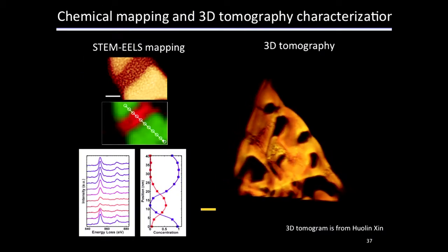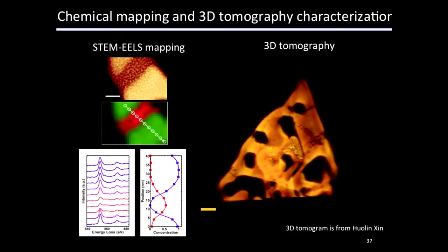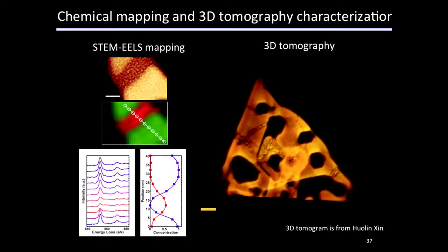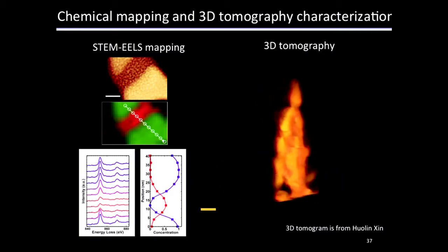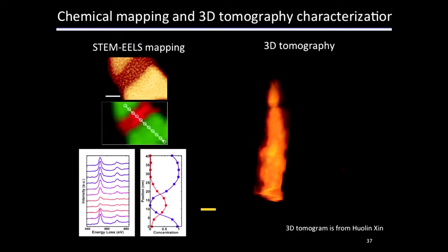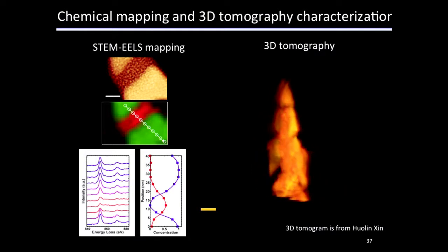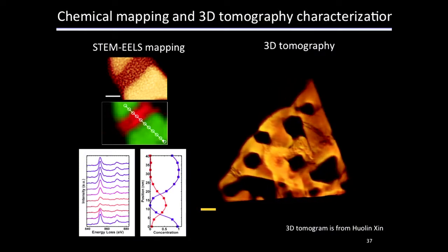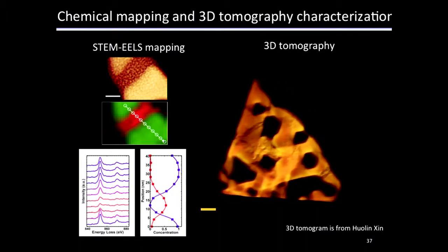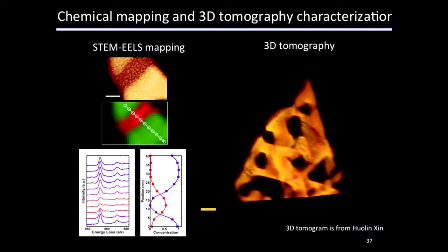So we did further analytical TEM. On the left is the STEM EELS result. This is an ADF image. We can see reaction fingers here. This one is an EELS mapping of this area. The red color represents the concentration of lithium. We can see there are lithium-rich areas. If we do an EELS line scan crossing the reaction fingers, we can measure the nickel L-edge. Then we can quantify the valence of the nickel. We see indeed at the finger area the nickel is reduced. So here we prove this one is really the reaction area.